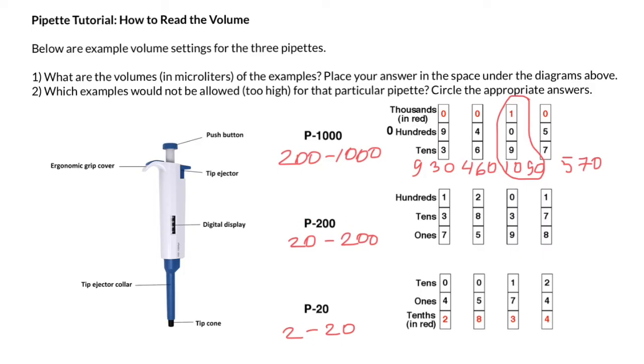Next one: P200. P stands for pipette. Usually we can find this label on top of this push button. As you see, we don't have here anything shown in red color. That means that we don't have here a decimal point. And the first reading is going to be 137 microliters. Second one, 285. Next one, 39 microliters. And the last one, 178. Pretty easy.